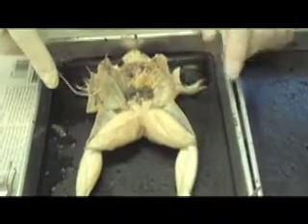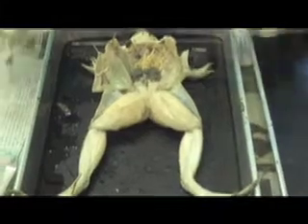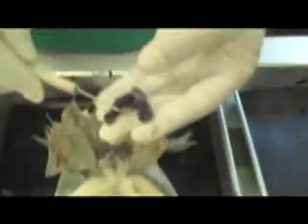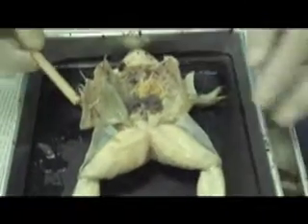The frog belongs to the class Amphibia. Frogs and toads make up 87% of all amphibians. They are made with special formations of lungs to breathe air, which we've shown today, right there. Also with a double circulatory system, again, which we've shown today, with the ventricle which pumps to both the lungs and the body. Just one ventricle does that. And the formation of limbs to move on land, but also webbed feet, which allow it to push through water and swim, and a rigid endoskeleton.